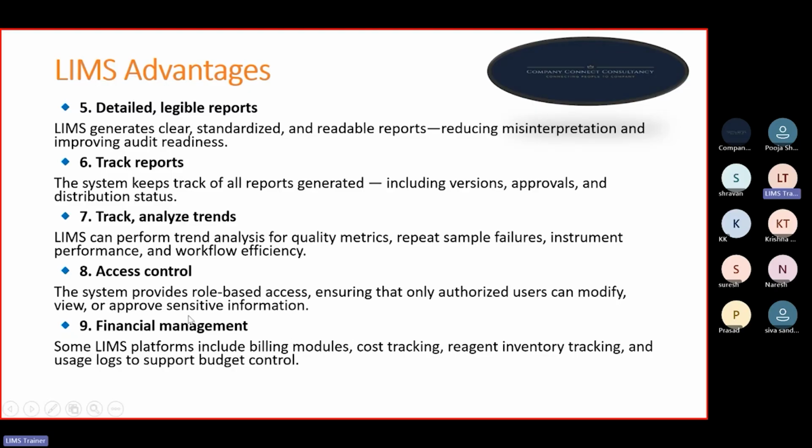Track reports, like I said, at the time of audit, we don't have to run here and there. We can just go into the system and track the reports. Track, analyze trends. In the laboratory, there are some trends that we need to document for stability and finished product. Some trend analysis also needs to be done. So that also can be performed in LIMS.